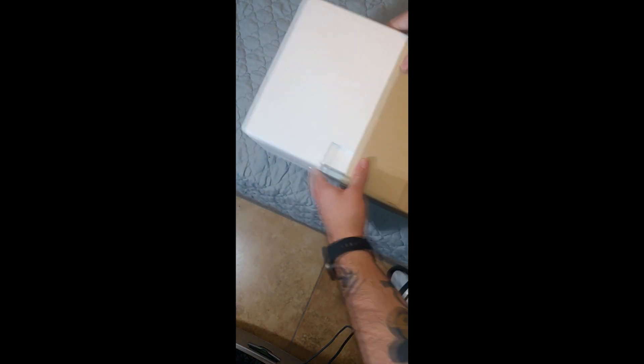You know, I just want to see what stuff looks like, learn a little bit — see what things look like under the microscope. It's got a little information: instruction manual, specifications, setup, operation, maintenance — all that good stuff. This will just be the unboxing; I'll try to get a nice setup going. Let me know if you all have ideas for what I could look at — like dirt, water, whatever.